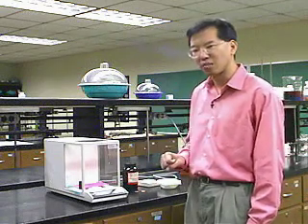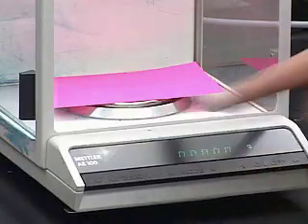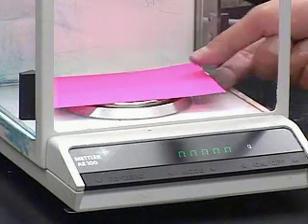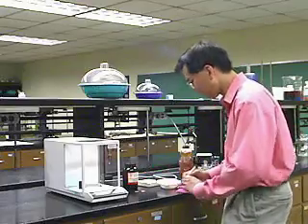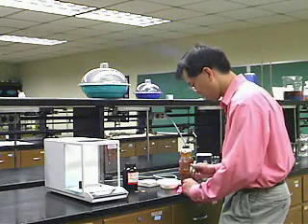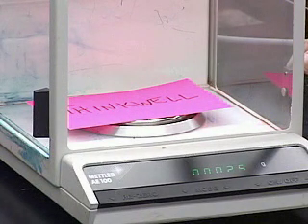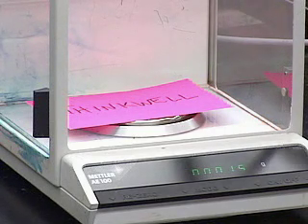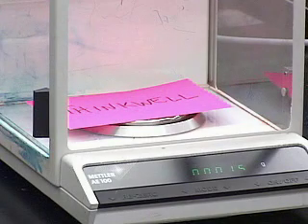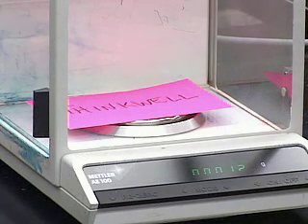You could write the initial number in your notebook and subtract after the second weighing, or you can use the tare feature to reset the balance to zero. Now when I write something on the card and weigh it again, it will just weigh the ink. Here's the card — the piece of paper is already accounted for using the tare feature. The ink weighs about 1.5 milligrams. This balance can weigh one-tenth of a milligram reasonably well — it fluctuates maybe a tenth of a milligram. It weighs very small amounts to reasonably high precision.